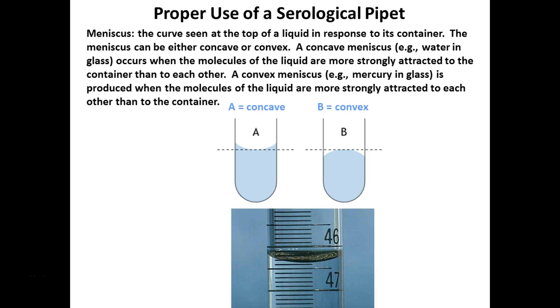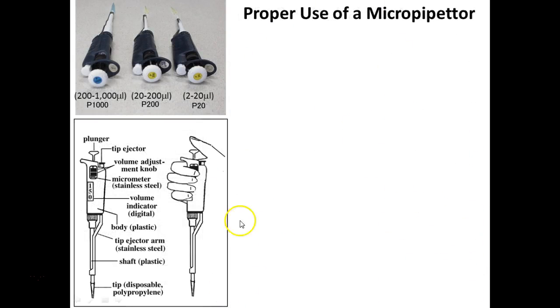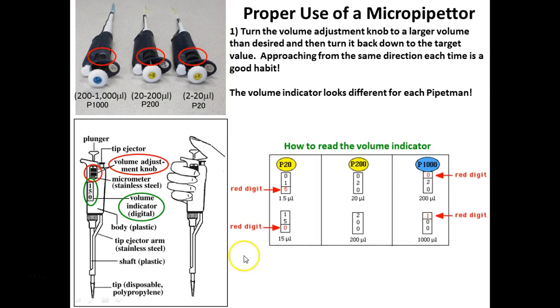In the laboratory, we wouldn't mouth pipette. Remember I mentioned this at the beginning of the semester when we were talking about safety, how we don't put these things in our mouths. We're actually trying to phase out using those and using more of the tools that are used more commonly in the trade now, and these are micropipettors. And so these are the ones that I'll let you guys work with today and go over how they work, how their numbering system is.